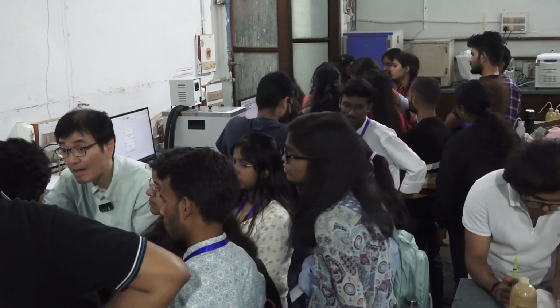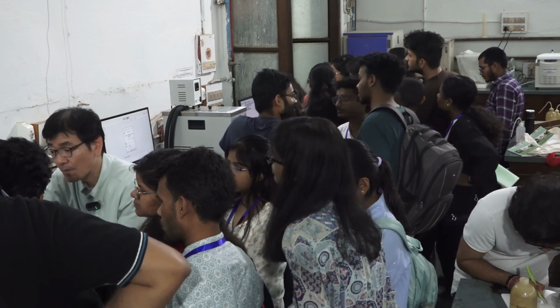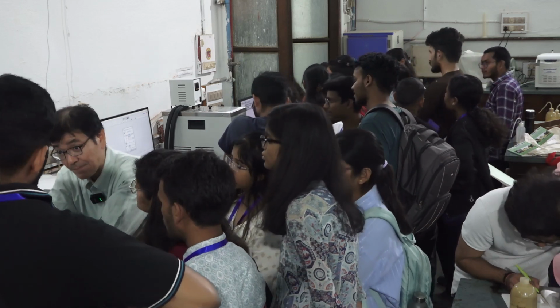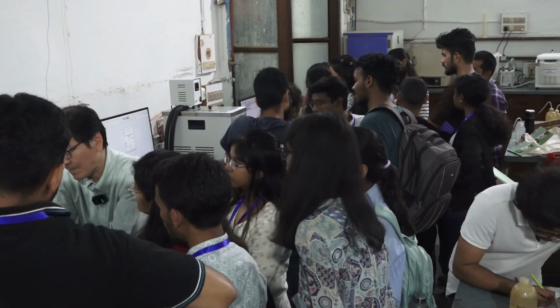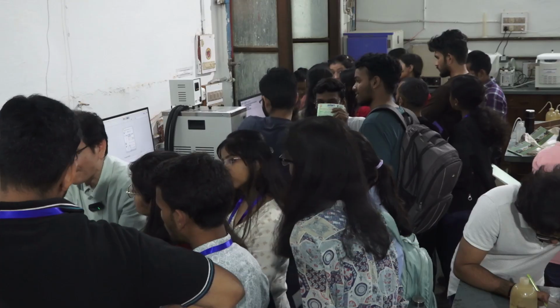When we record the next sample, we need to do an I0 scan. I0 scan is air. Yeah, every time, as far as using this software.